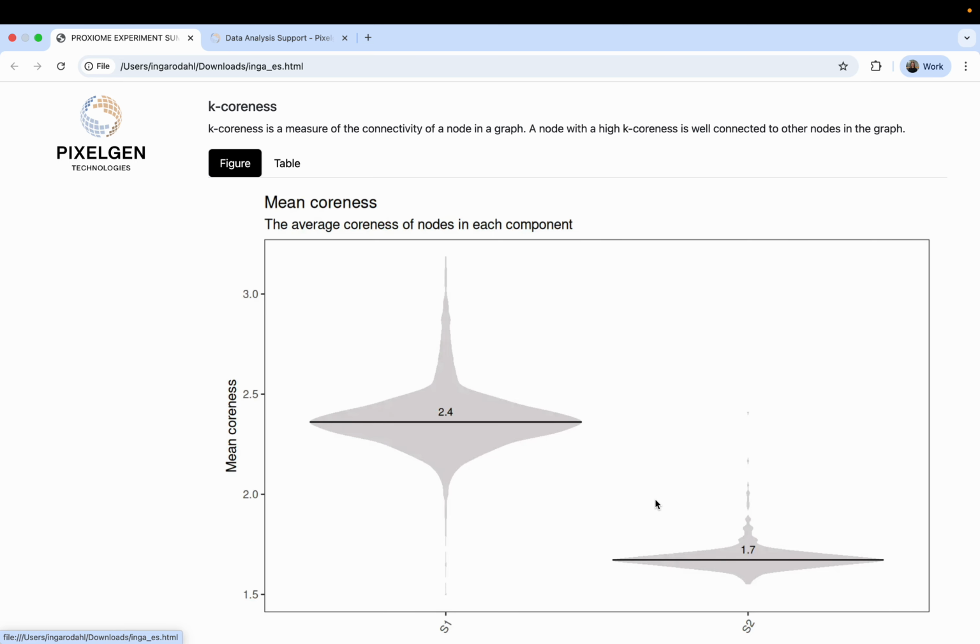And again, by visual inspection, you can compare between the different samples that there are quite a few changes happening for each cell subset. So now I'm just going through each of them. And then lastly, also the B cells. So here, again, you can see there's quite a spatial reorganization happening.